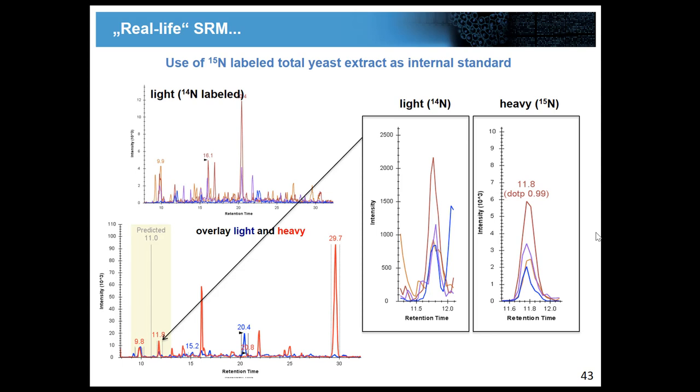So by taking all the 6 tools I have in hand, including the heavy reference, which wasn't a spike-in but a complete proteome, I was quite confident and could quantify this peptide. Before, it would have been impossible to do this, okay?